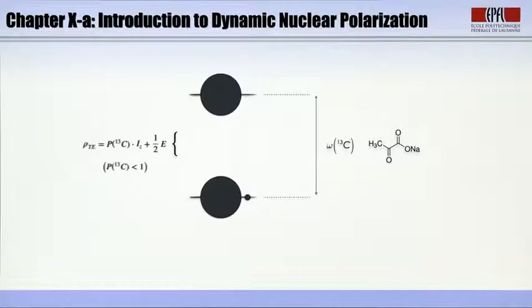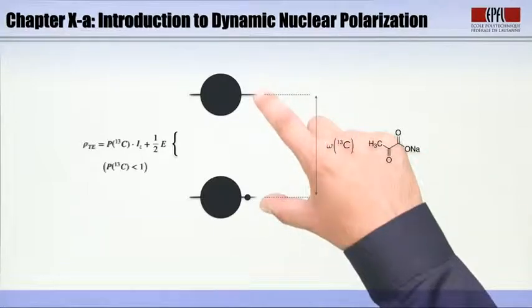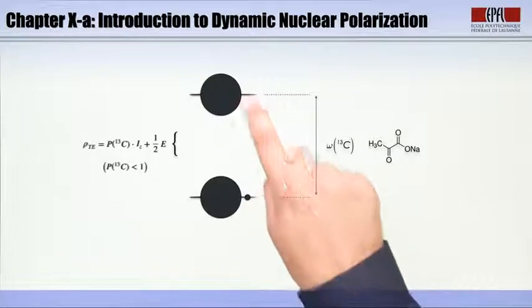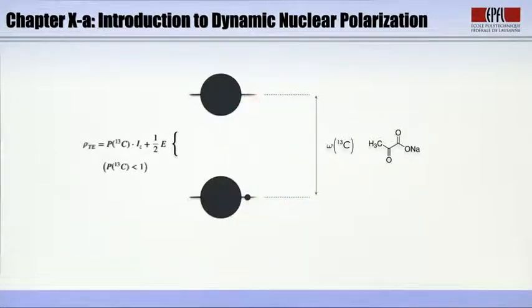In the picture here, you see the two energy levels of a spin 1/2. The balls describe the amount of populations of spins up and spin down. As you can see on this picture, there is almost as many spin up than spin down described by these big balls. Still, there is a very little amount of spins in excess on the energy level up with respect to the energy level down. And this is precisely what the polarization factor describes. The important thing here is that this polarization factor is usually much smaller than 1.